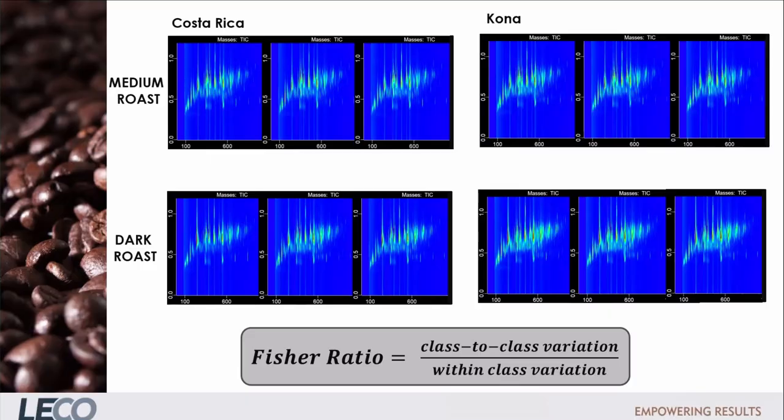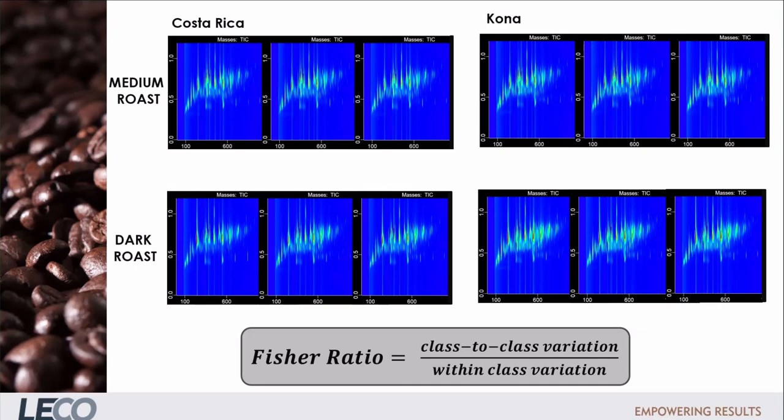For this project we use the Fisher Ratio option in ChromaTOF Tile. This is the class to class variation relative to the within class variation. It's a nice choice here because it helps highlight differences between specific sample classes in data sets where other variation and differences are also expected. So we can focus on the roast level differences for example and ignore the origin differences.